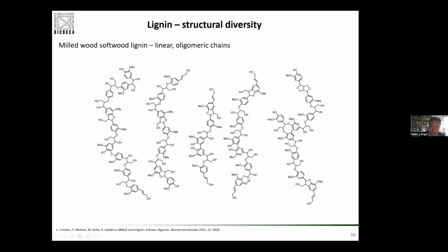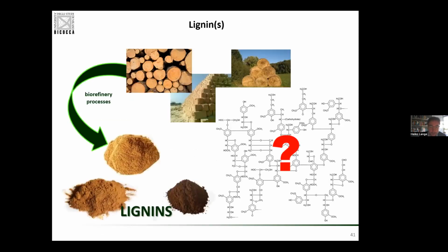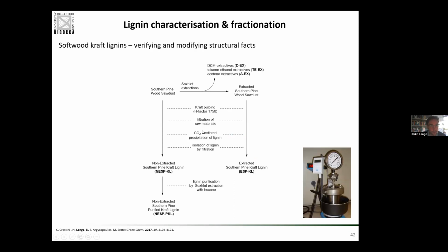Because if you see here, for example, you see already that I have really small structures. And I have eventually some larger structures, right? I have some structures with more phenolics and I have structures with less phenolics. So all this, via the various physicochemical interactions that we have in a system where I've tried to dissolve my lignin in a solvent, gives me eventually a handle to do a separation of different fractions of all these thousands of possibilities of molecules. Once I have the fractions, I can analyze each of the fractions separately with my set of analysis tools in terms of HSQC or phosphorus NMR.